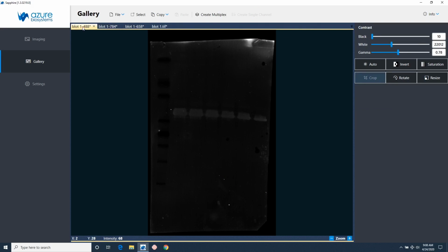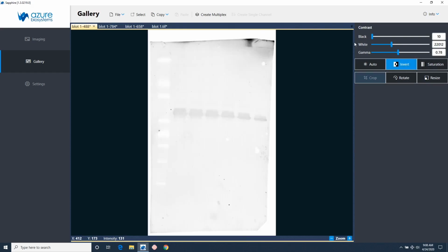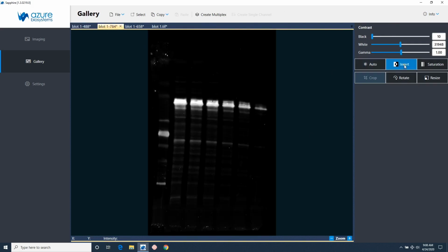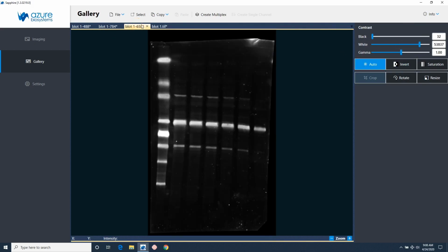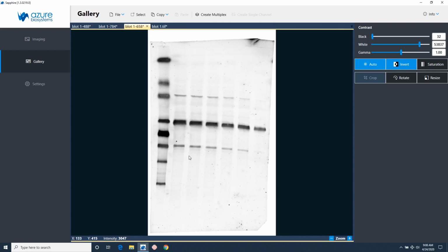So this is your 488. Now if I wish, I can click the invert on that, click on auto, and I have my bands there. Here's my 800 channel. I can invert it also, and if I wish, I can adjust it. And then here is my 700 channel.